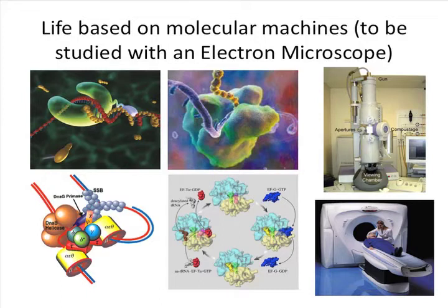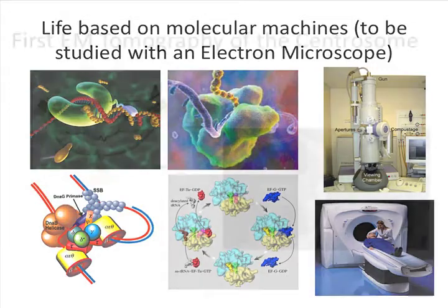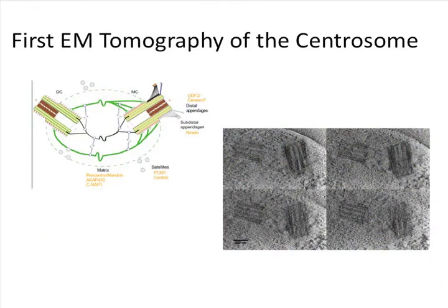So this is really the normal work we do in the lab, that of course we can take to the cell dimension with tomography, with cryo-electron tomography. What you are seeing here is a centrosome, our first data on that. If you think about ciliary diseases and all that, this is the molecular basis of many of them.